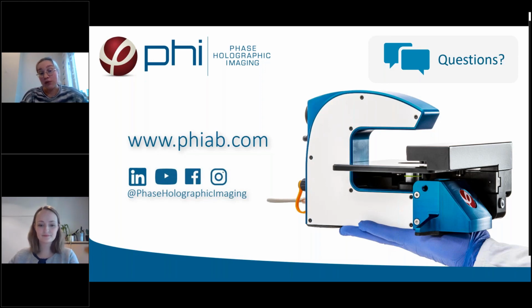But I would say that the most important thing here is that we not only image one position per well, but we can actually do multiple positions per well to get a larger sample imaged.